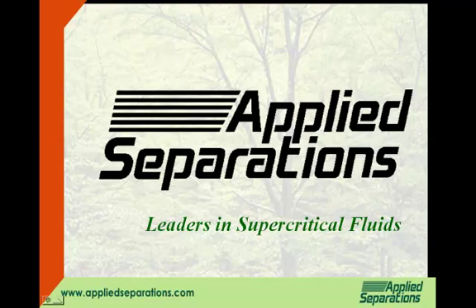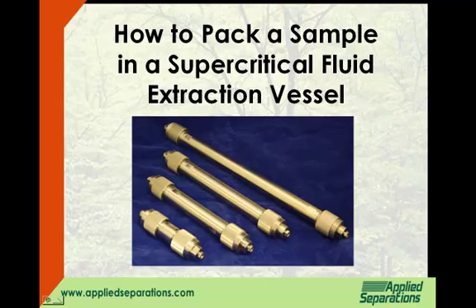Welcome to Applied Separations. Congratulations on purchasing your SFE. In this video, we will show you how to pack a sample into your supercritical fluid extraction vessel.